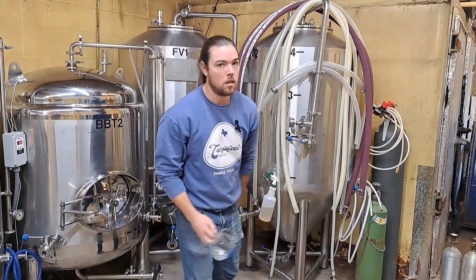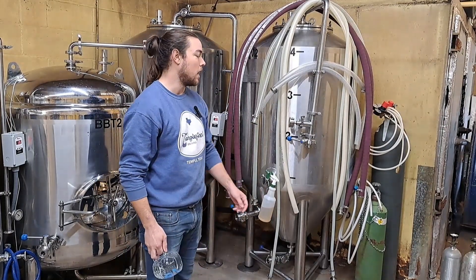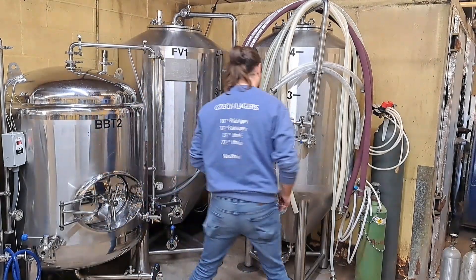This is going to be a quick one today. I'm going to go over how I perform a diacetyl test and explain why. First you have to take a sample — this is the tank right here that has the beer we need to perform a diacetyl test on. This happens to be a batch of 12 degree pale lager.